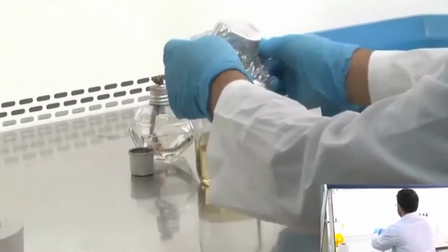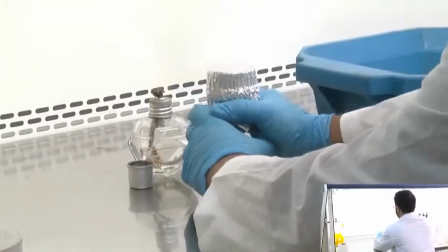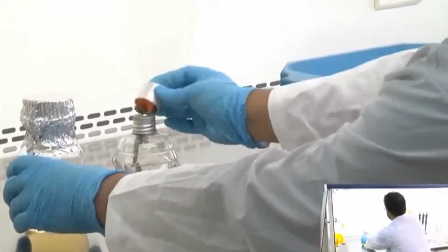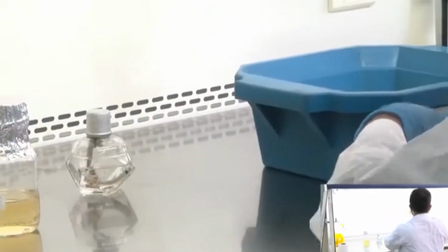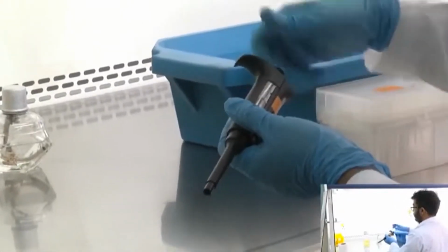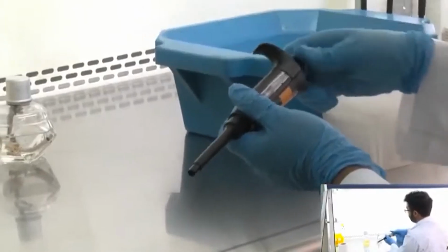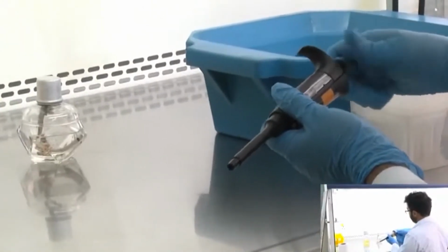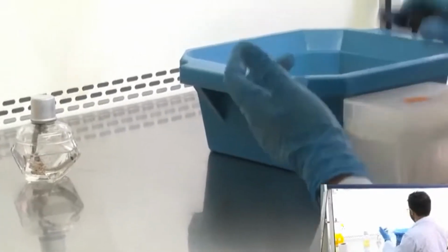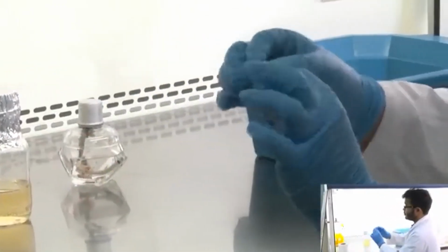Let me just take care of my media so that we can use it again in the evening. And yes, I will also release my pipette. Now you can take a couple of minutes to make sure that your pipette is released, you have turned off the spirit lamp and you have taken care of your media. During the earlier step of heat shock, timing was more crucial, but now it's okay.